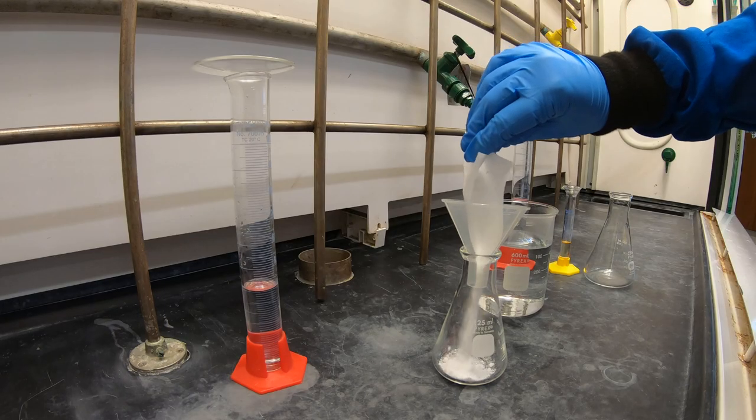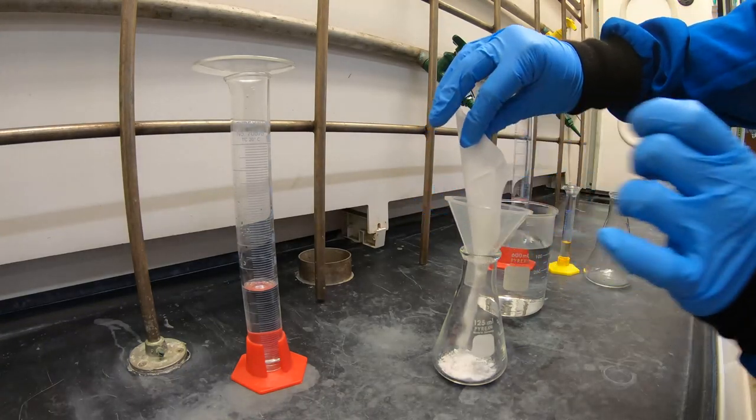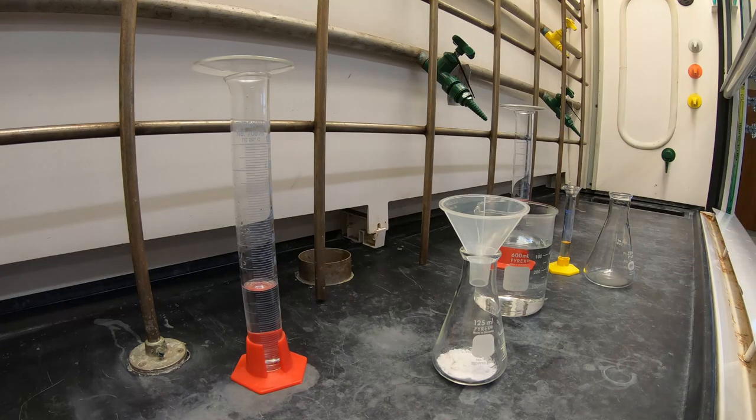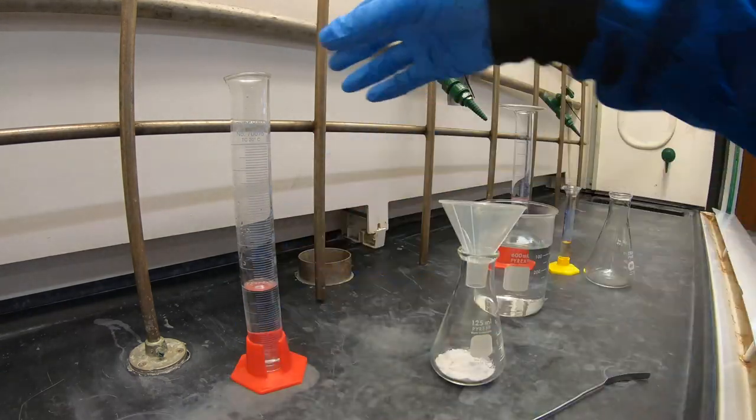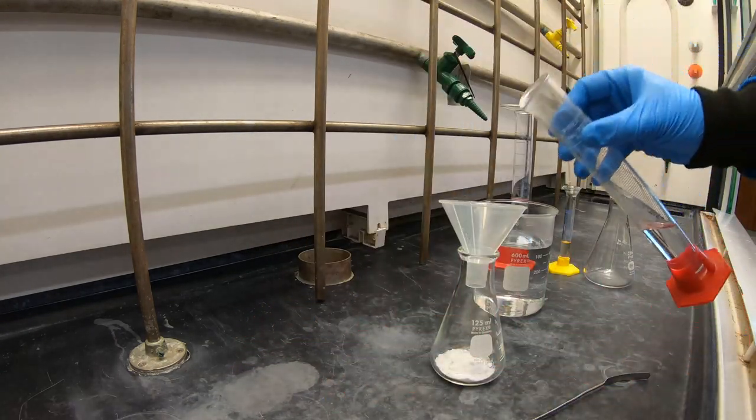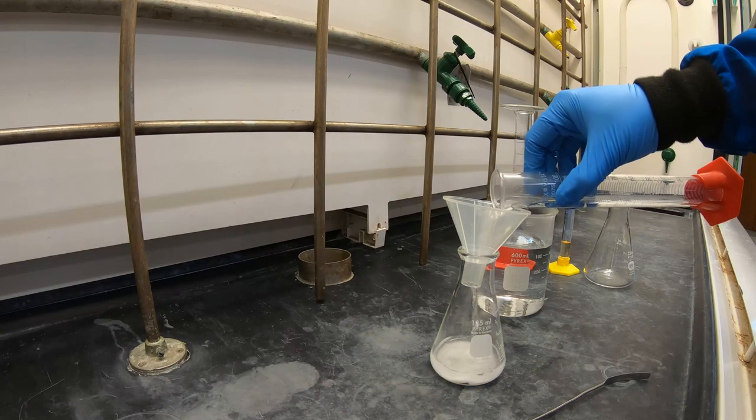Experiment 6: Synthesis of Lidocaine. Begin by adding 0.1 moles of tin chloride to your 125 milliliter Erlenmeyer flask, then dissolve the solid by adding 40 mls of concentrated hydrochloric acid and stirring well.